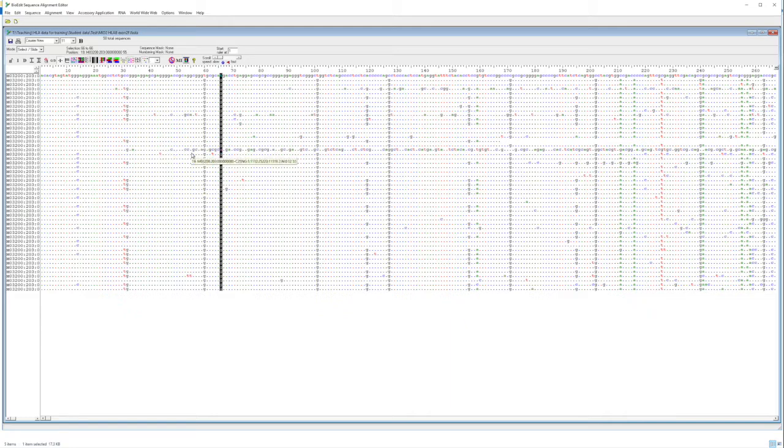The next thing that stands out is I have one sequence here which is in agreement with the other sequences for the start of the sequence, but then is basically in complete disagreement for most of the read. And now what has caused this? Generally this would be caused by one of 2 things called indels, insertions and deletions.